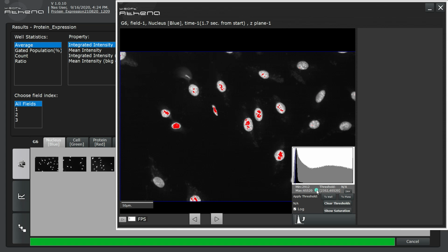We can use the intensity histogram plot to manually set the contrast range. Setting contrast ranges allows for improved human visualization of the image and can permit qualitative brightness comparisons between images, but does not change or in any way impact the raw pixel values saved in the image file.